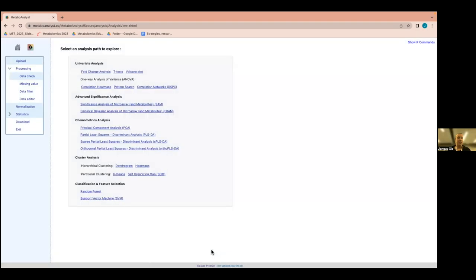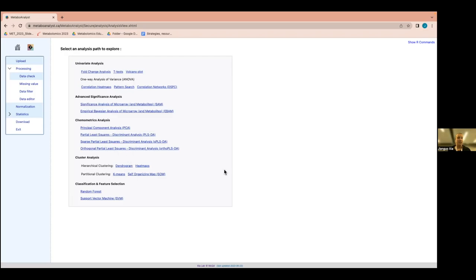Now we're at all of the statistical analysis tools. There are a lot here — the most common ones are univariate statistical analysis like a t-test, and dimension reduction like PCA so you can see the overall distribution of samples, outliers, and main patterns. There are also options for generating heat maps and network diagrams covering all the statistical methods Jeff covered earlier. I usually start with PCA for an overview, then do univariate analysis, then more complicated heat maps and network diagrams.